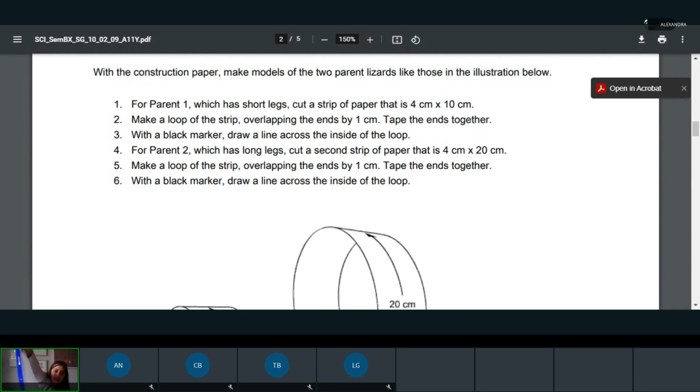Then you're going to make a line where you get to 10 centimeters. Okay, so again, if I'm holding it up closely, 10 centimeters. I've got my ruler at the edge of where the 0 starts, and then I'm measuring 10 centimeters, and then I'm drawing a line. 10 centimeters is right here. Can you see that? And then I'm going to draw a line. Okay, so go ahead and do that.